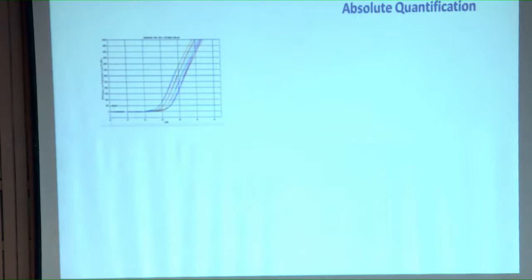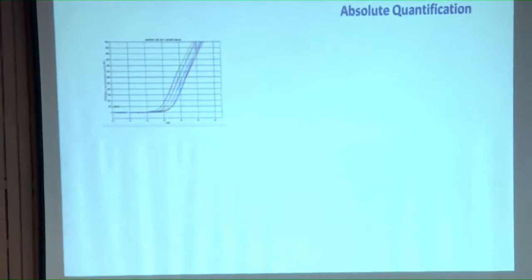In absolute quantitation, it's quite simple. Suppose you know the target, for example, a gene in an insect. So what you do, you develop a standard curve. You plot the concentration of that particular gene in terms of nanograms or picograms versus the CQ values that the machine is going to generate. You set up a PCR reaction with differential quantities of your template DNA. Is it clear? If it is RNA, you convert it into cDNA and use the cDNA as a template.